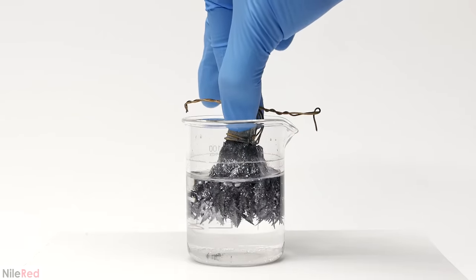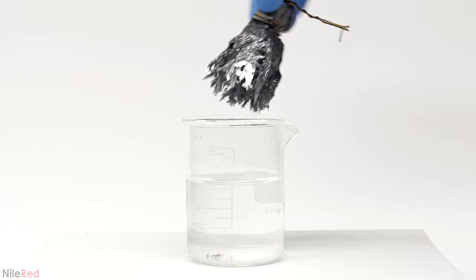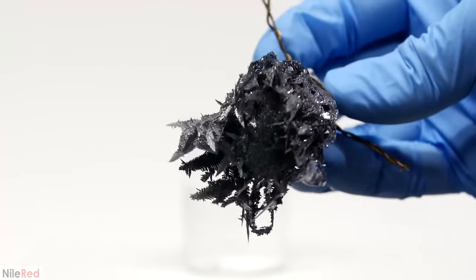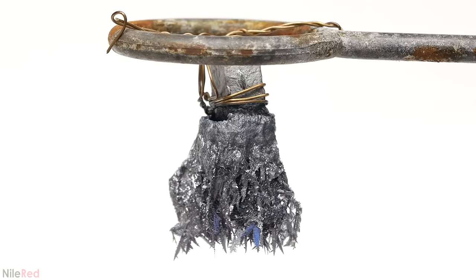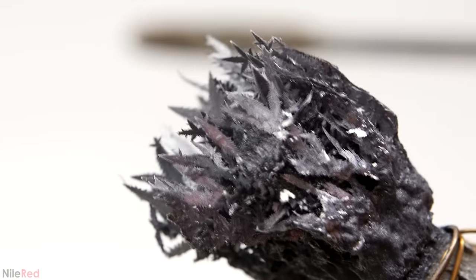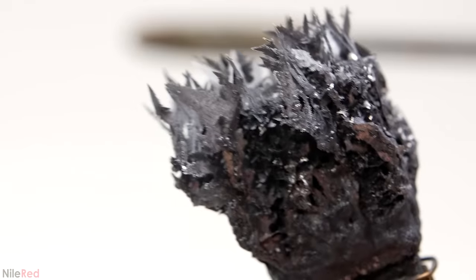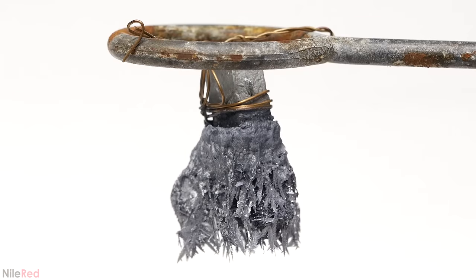I was really curious to see if it were possible to preserve this, but the moment I took it out of the water, it all kind of collapsed on itself. It still looked kind of cool though, so I figured I might as well try. Within just several minutes of sitting out, it already started to lose its shininess. This is due to the formation of lead carbonate, as the lead metal reacts with moisture and air. It deposits as a thin white layer on the surface which dulls out its appearance. I let it sit out for a little while longer, but it just got worse and worse. I imagine if I just left it, it would eventually turn completely white.